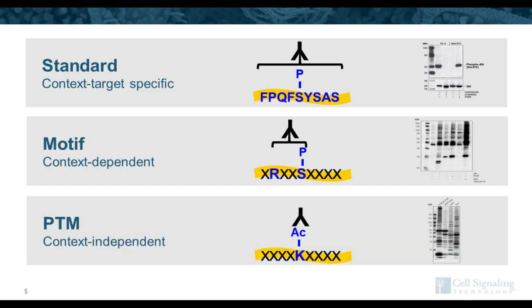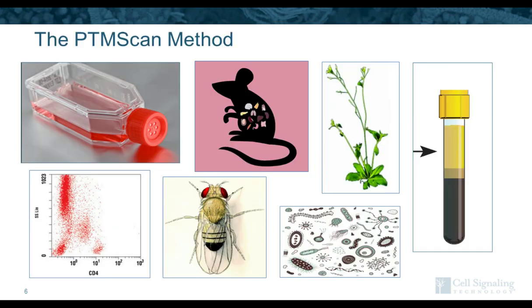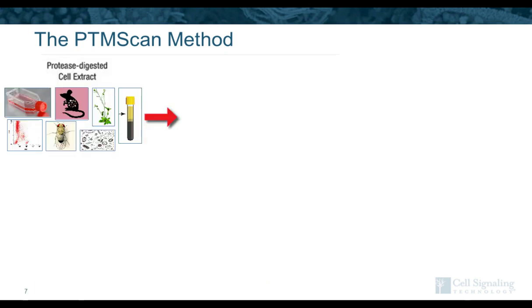So we can do this for phosphorylation motifs. We can also do it for other PTMs, like acetylation, again using that degenerate peptide library approach. So we then take these specialized antibodies and use them in the method, and it's really pretty flexible with respect to the types of material you can use as input. So we can do PTM Scan on cell lines, tissues, plant material, whole organisms, microbial samples, primary cells or sorted cells, even serum or plasma.